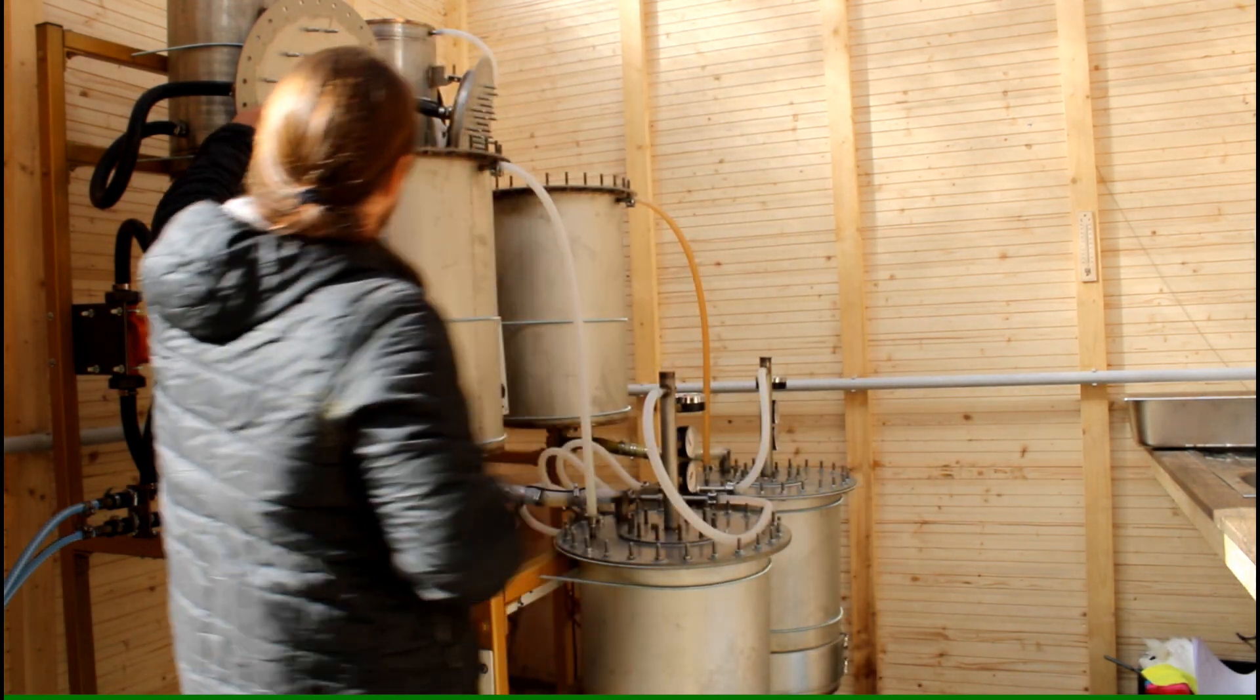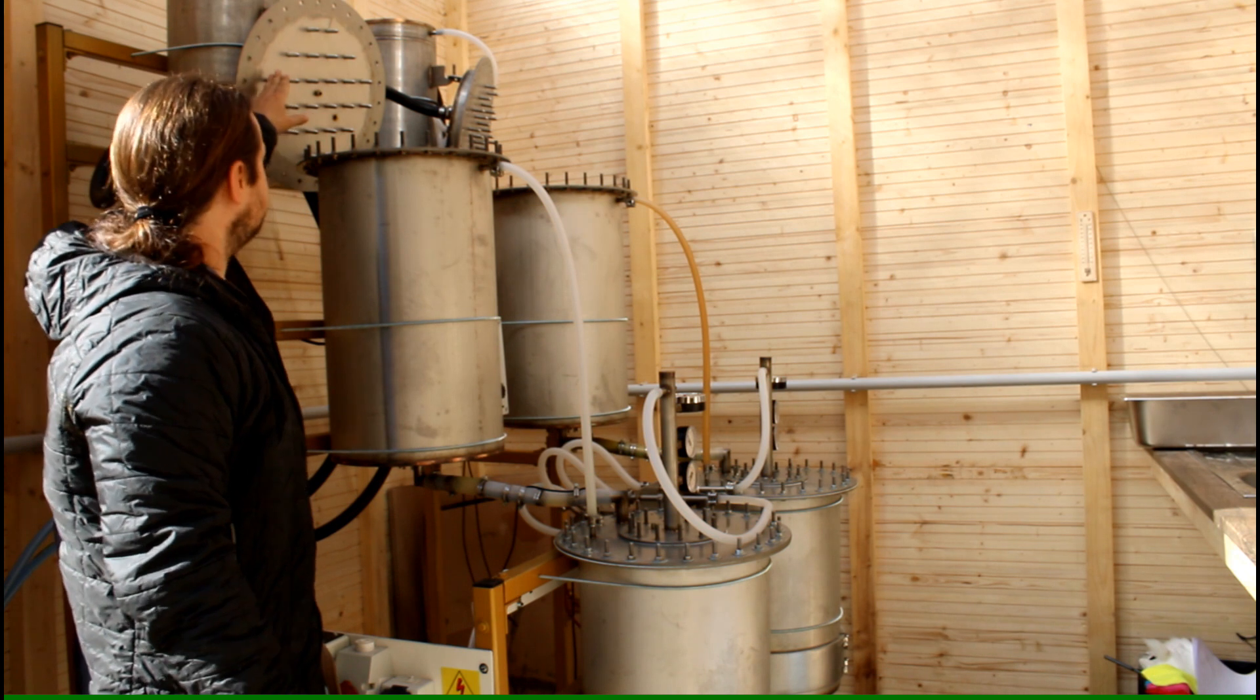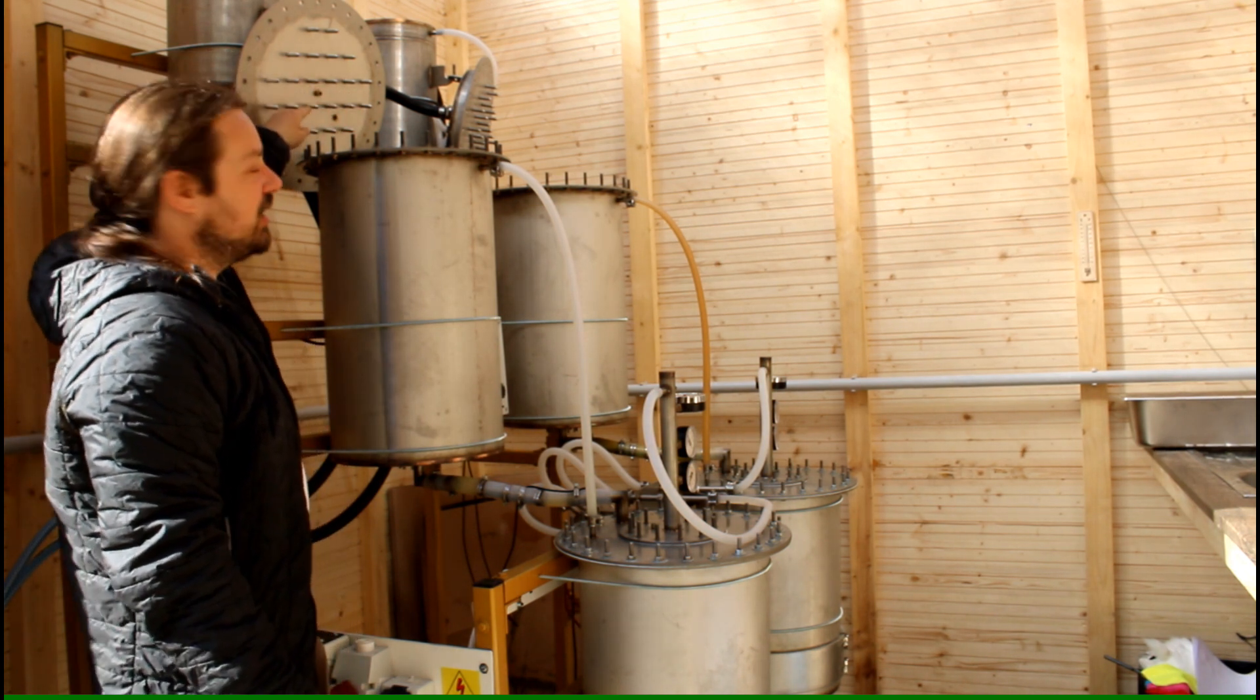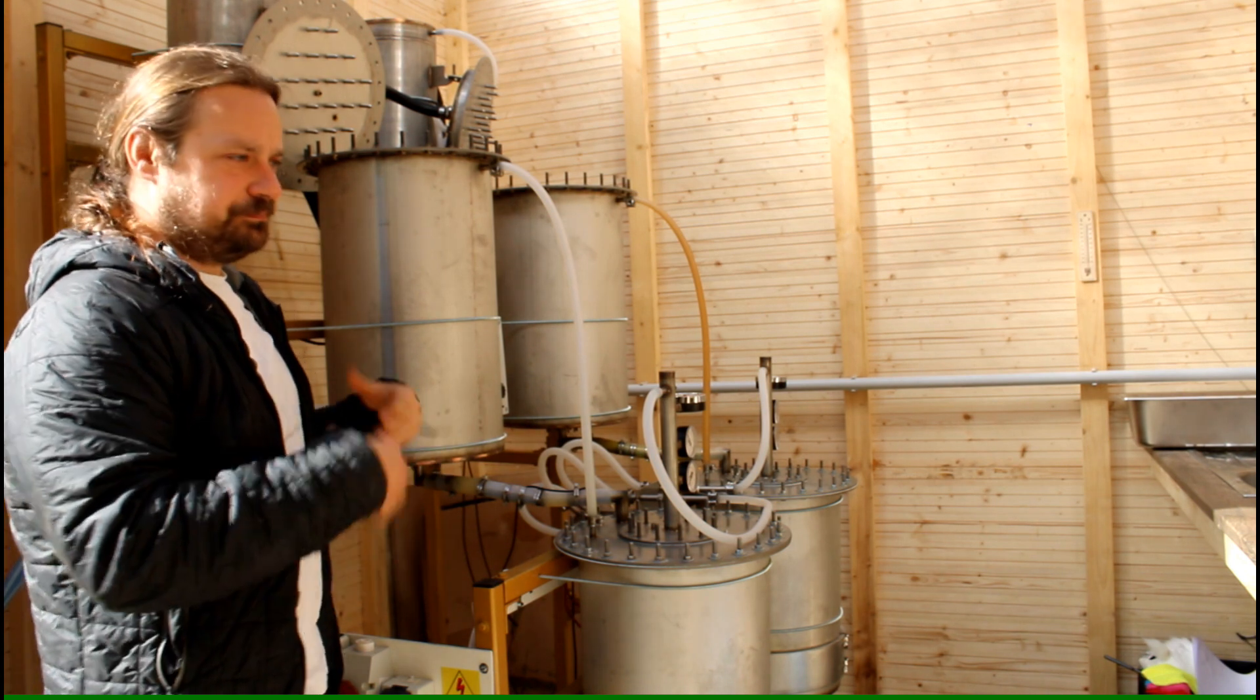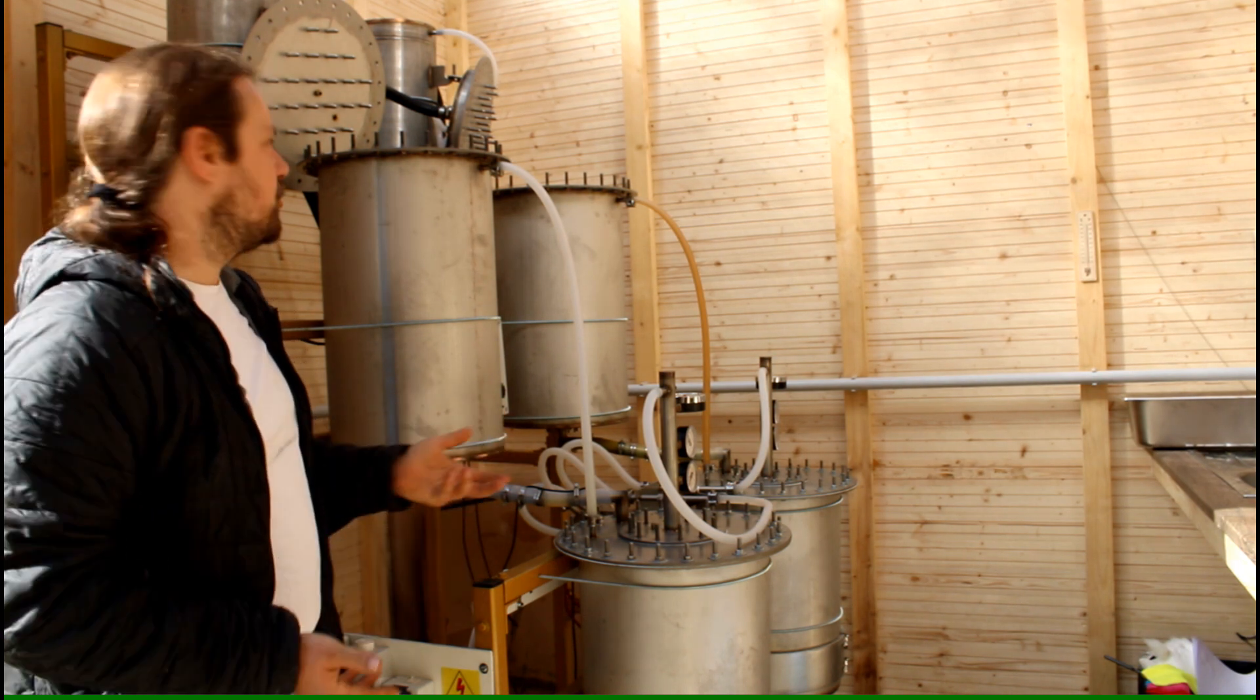And start to condense here on that actively cooled lid here. So the spikes that you can see, they are actually there as nucleation points for the vapor to start forming drops.